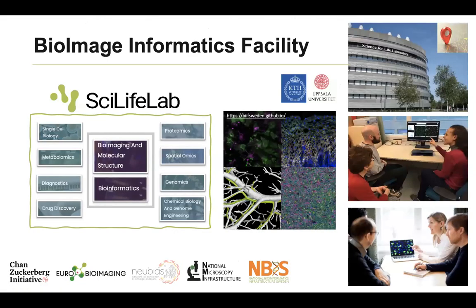When I went to Sweden, I joined the team of the bioimage informatics facility, which is one of the core facilities of the research infrastructure called the Science for Life Laboratory. We are connected to the bioimaging and the bioinformatics platform. So we help users in Sweden to perform image analysis pipelines. We try to bridge the gap between their user needs and the available tools and technologies. Here is our website for projects. If you're interested to know more, I'm going to show some examples soon.